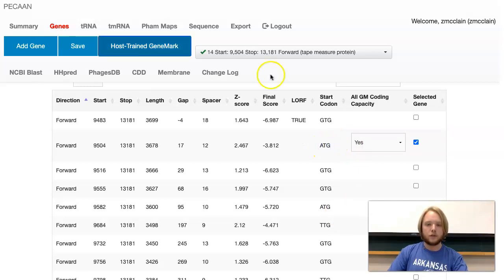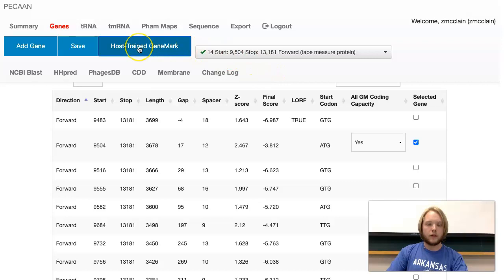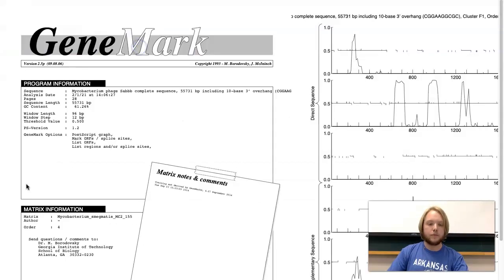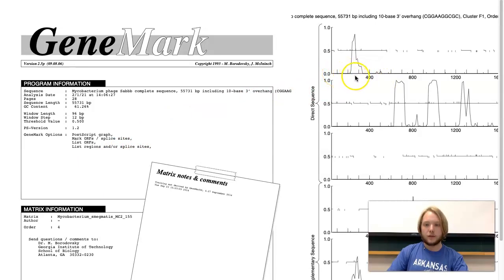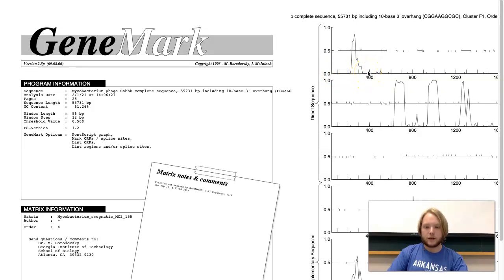So, here's how you pull up GeneMark while annotating a phage. If you are in Pecan, you go over here, and you click on host trained GeneMark. It should pull up this graph, and this is GeneMark. If you look over here, you can see these numbers and these ticks. This is 100 base pairs, 200 base pairs, 300 base pairs, and 400 base pairs into the genome.